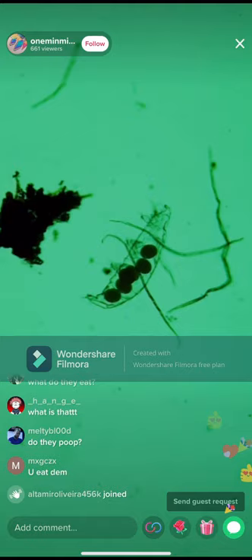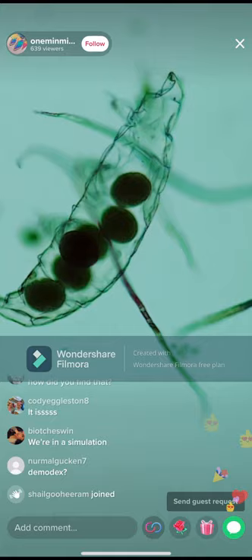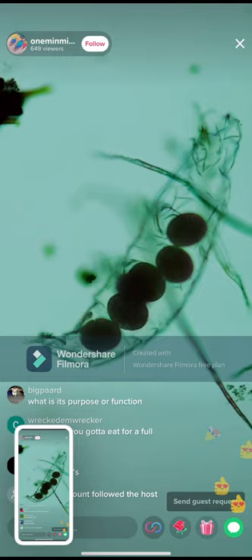Really interestingly, in this sample we have tardigrade eggs — check this out. That's what I want to show you all today. That was the purpose of this live stream: just to show you tardigrade eggs and give you a little bit of an idea of their reproductive cycle.